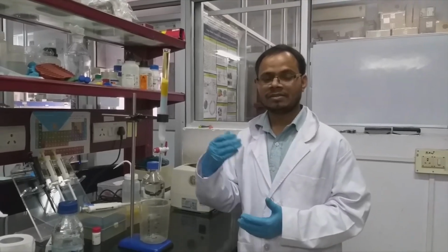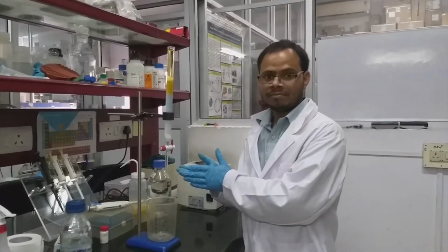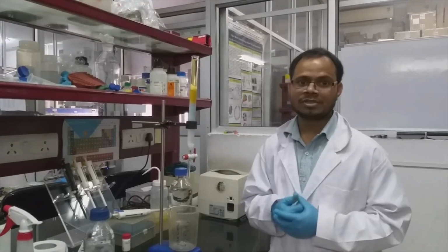Suppose you are separating three different proteins, one is 70 kDa, another is 100 kDa, another is 300 kDa. So according to this principle of gel filtration chromatography, by their size and shape, the 300 kDa protein elutes first. You have to collect the fractions from the initial fractions, which give you the 300 kDa protein, and the 100 kDa comes later, and at last the 70 kDa protein elutes. But after collecting, how do you know these proteins have their corresponding molecular weights?